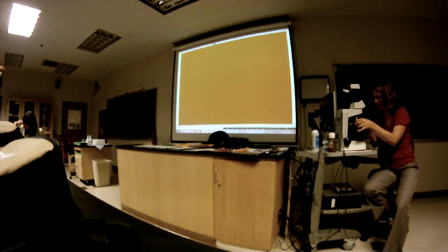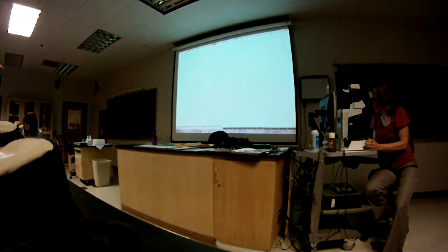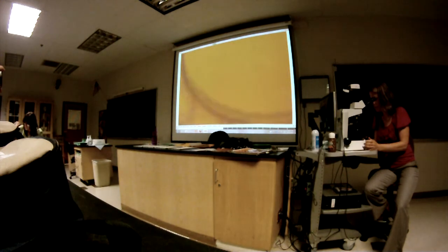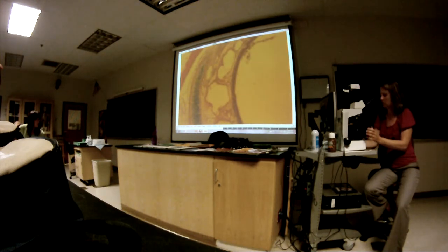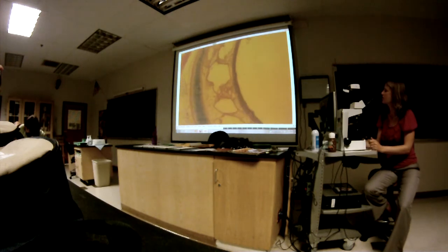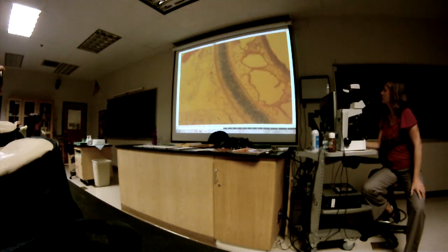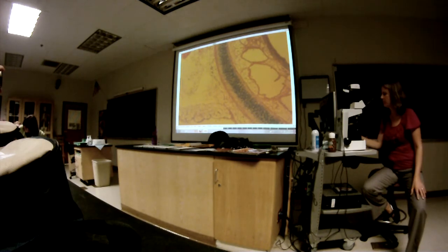All right, so the trachea has the tracheal cartilages. What kind of tissue is that? Hyaline cartilage. Good. Great. And the trachealis muscle, what kind of tissue is that? Smooth muscle. Good. So there are the blood vessels located right in that areolar tissue. Okay, so here's the hyaline cartilage. Great. So the structure is called the tracheal cartilage. The tissue is the hyaline cartilage. So remember the difference between that.